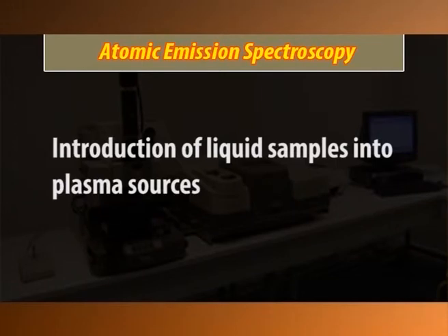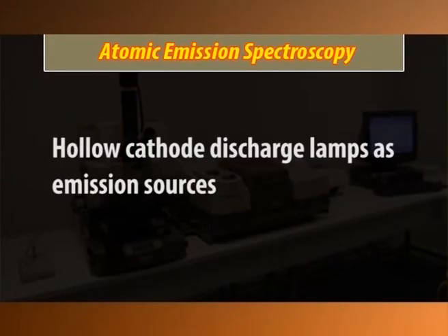Introduction of liquid samples into the plasma sources. Liquid sample introduction is equally important in plasma methods. In all cases, the analysis can be only as good as sample introduction. However, optimum conditions for the sample introduction into the plasma sources differ markedly from those for the flame atomic absorption sources.